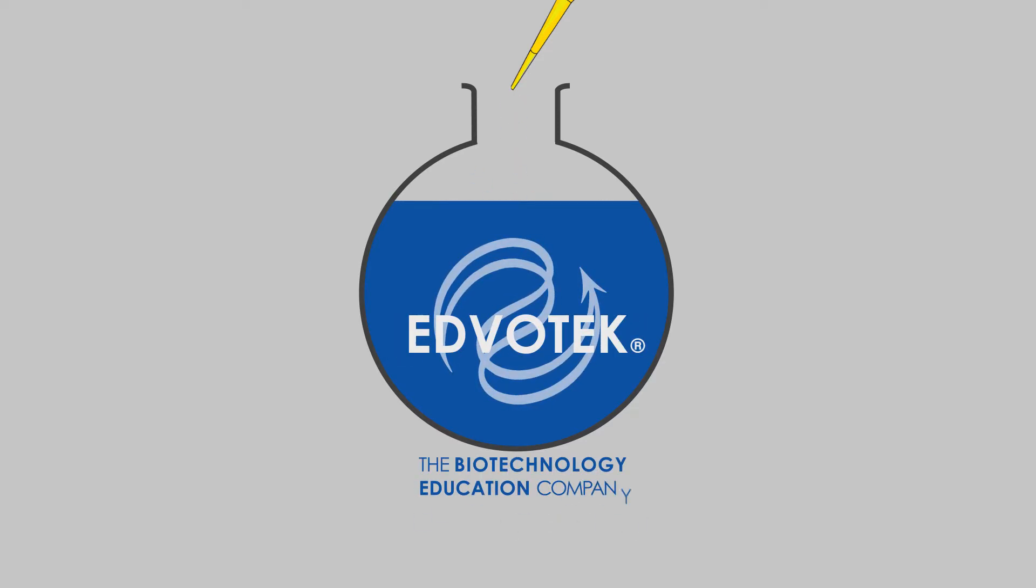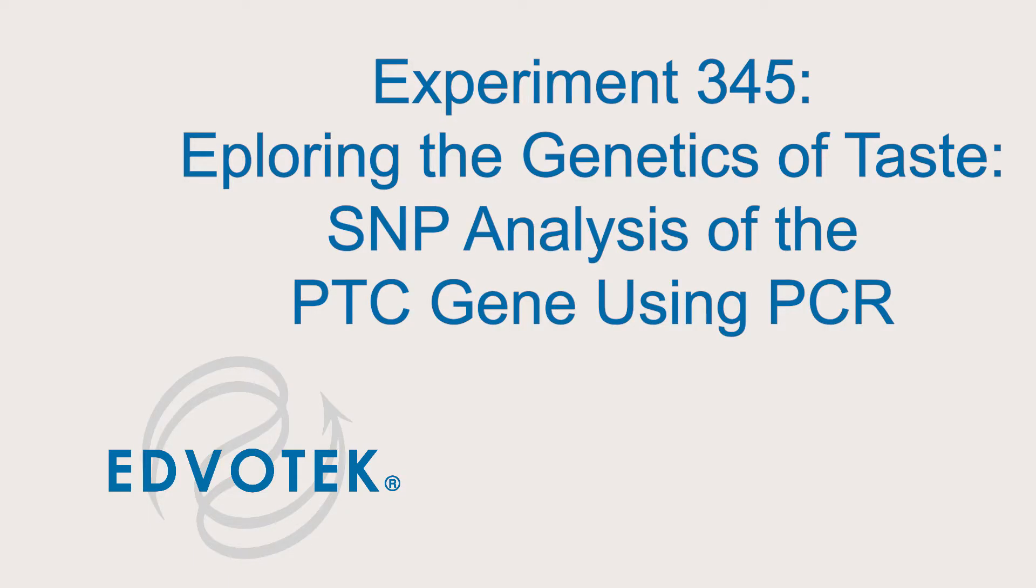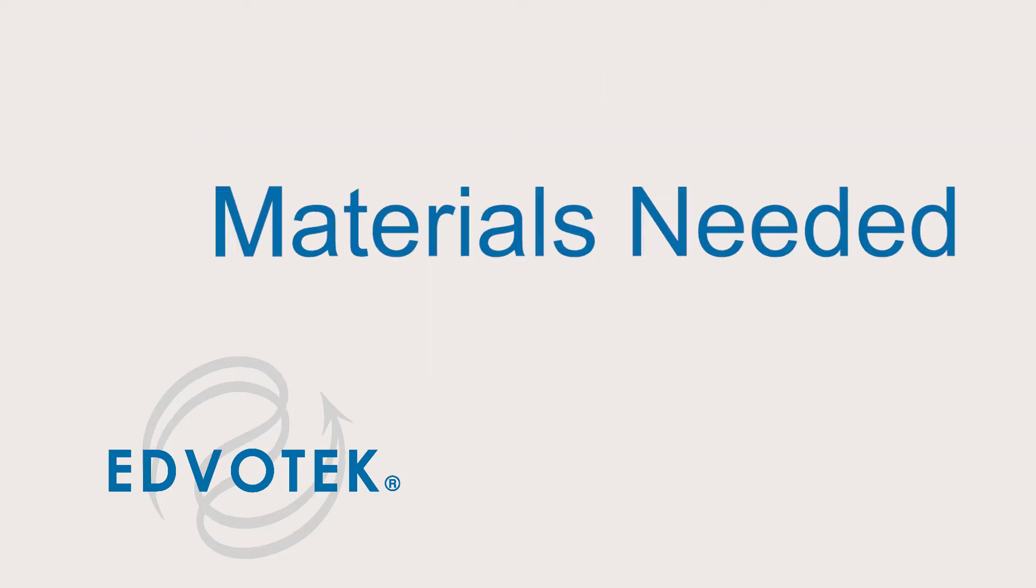Edvotek instructional videos presents Experiment 345: Exploring the Genetics of Taste - SNP Analysis of the PTC Gene Using PCR.